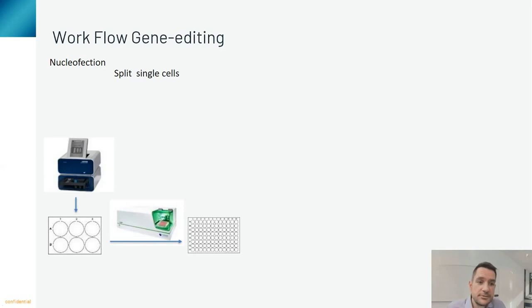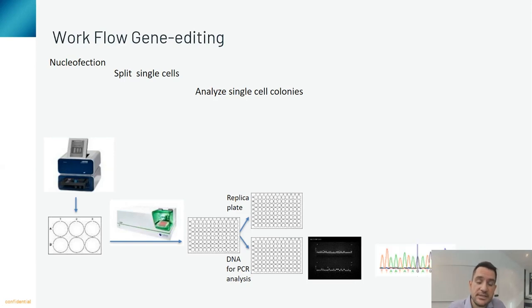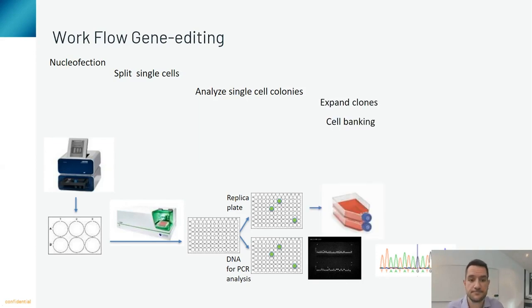A few weeks later, we screen those cells. When they have grown dense enough, they are split into a replica plate that we keep in cell culture and into a DNA plate. This DNA plate is then screened by, for example, just PCR, if possible, or with a restriction enzyme assay. Based on this screening, we select positive candidate clones, which are then confirmed by sequencing. We trace these clones back in the cell culture, find them there and split them, we bank them, and then finally we perform quality controls.